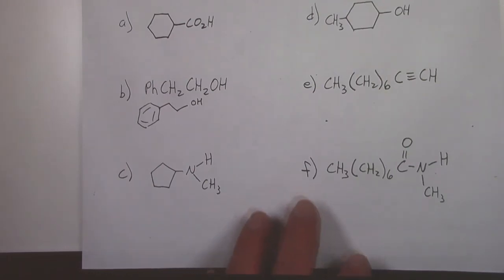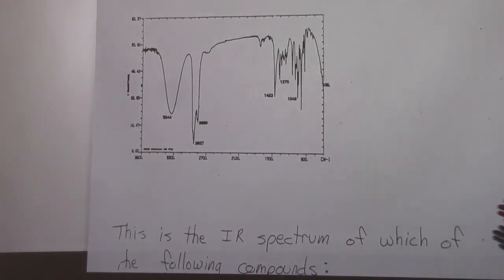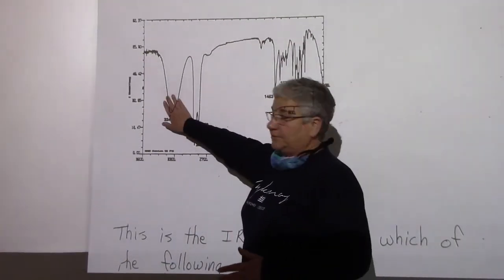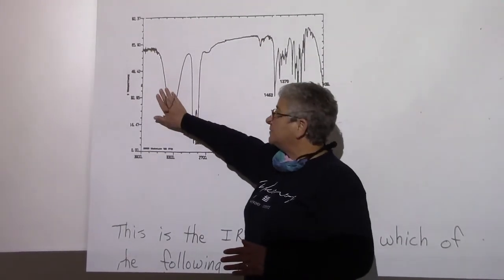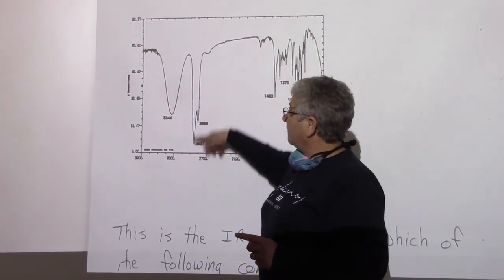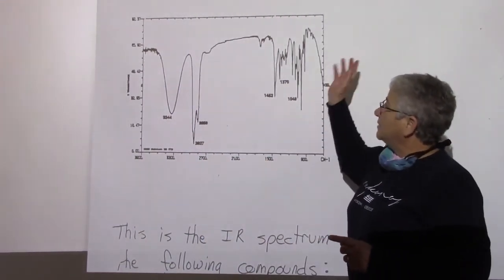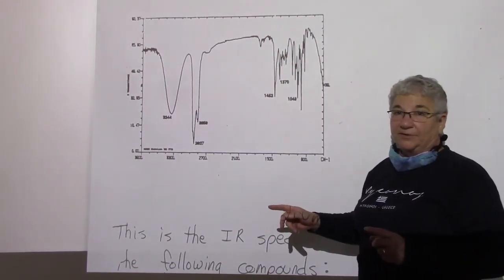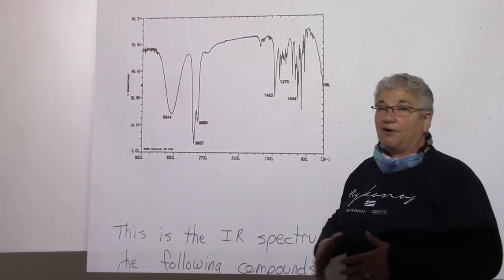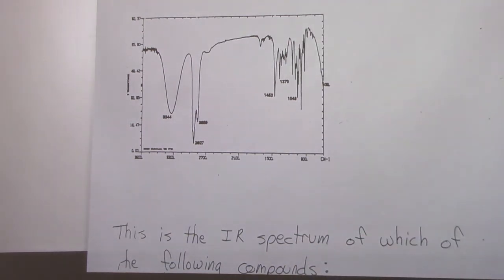So now that you've come back, when I look at this spectrum, I instantly see an alcohol, right? This is a classic alcohol stretch. So I know I have an alcohol in my molecule. CH saturated, that doesn't help me very much. No triple bonds, no carbonyl, right? So no carbonyl and an alcohol, I ought to be able to figure out what my spectrum should look like, or which one of these choices it is.